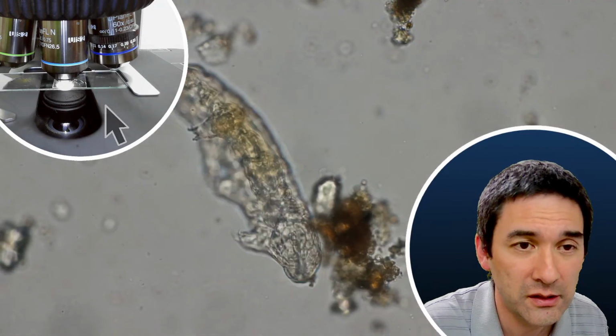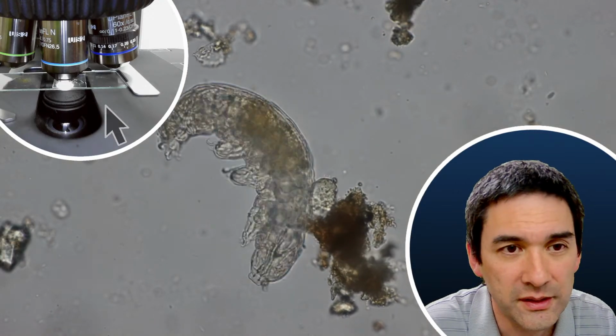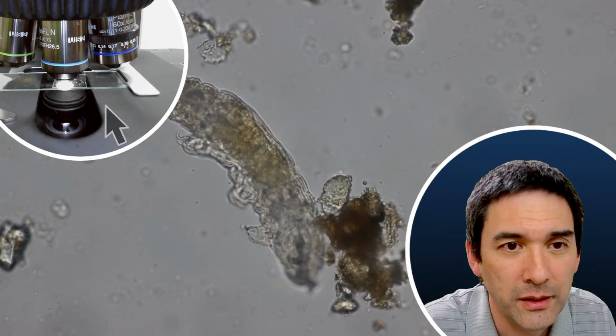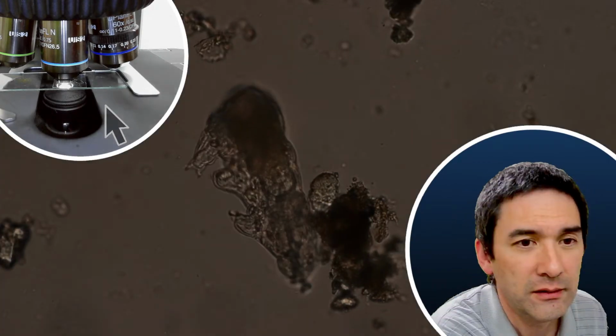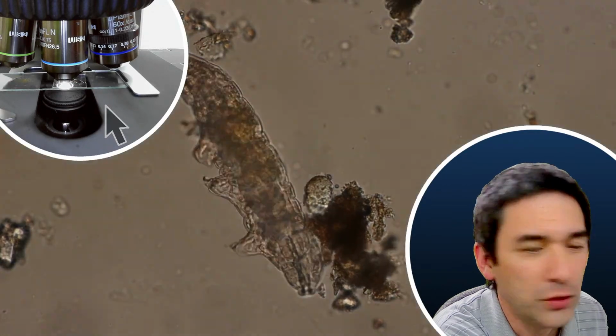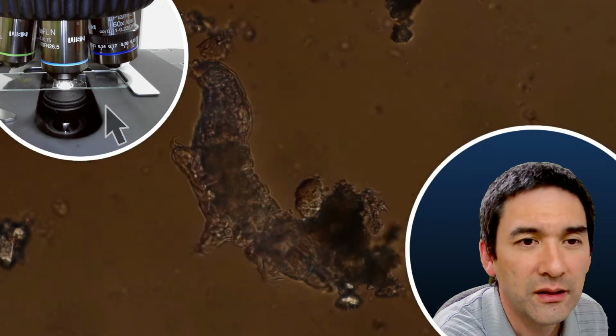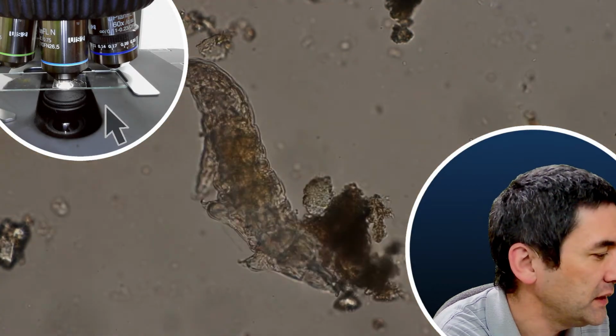Okay, so that's basically how it's the standard view. Then DIC uses a lot of light, and if you adjust it properly, you're going to see that there is slightly more contrast. And now let's do the following.